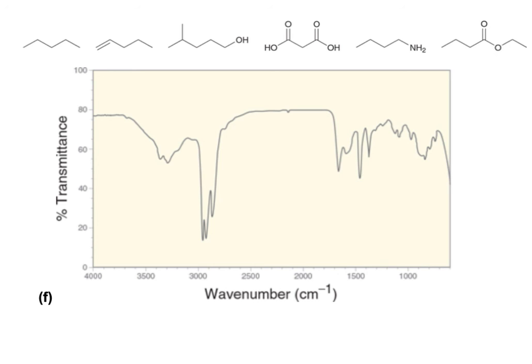So this is what you're going to have to do. You're going to take IR spectra in lab and make sure it corresponds to the molecule that you're analyzing, and I'm going to give you IR spectra in your lecture problems.